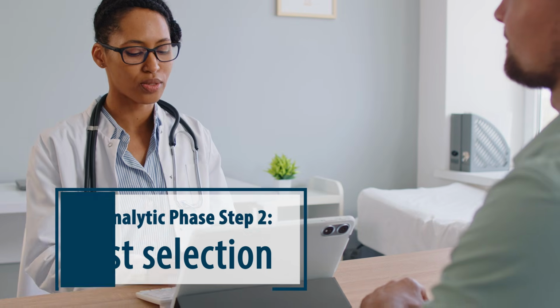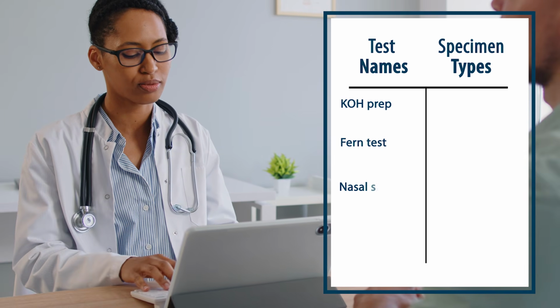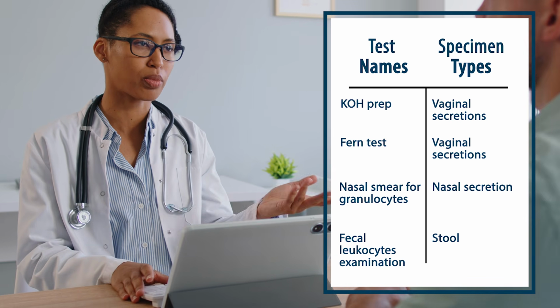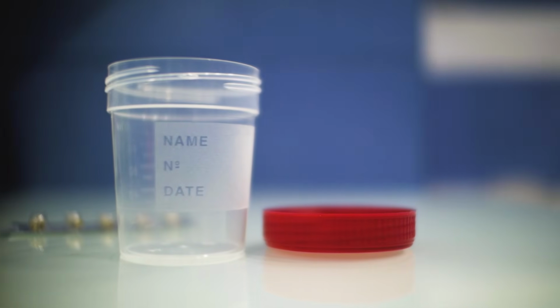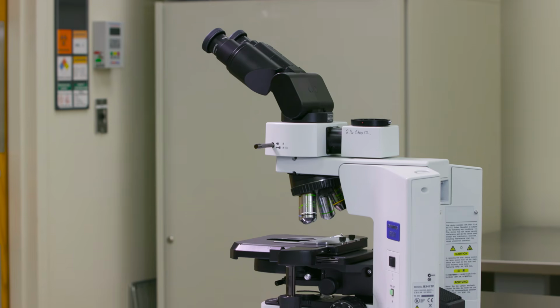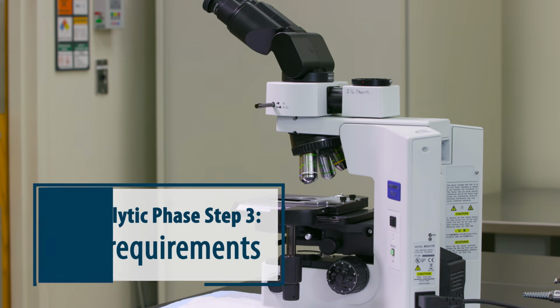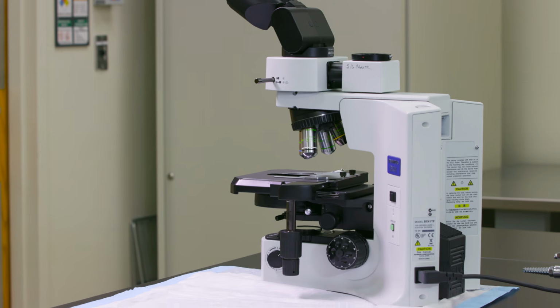One challenge during the pre-analytic phase is the potential for confusion about the correct specimen type required for each test. Review the test requirements to confirm the appropriate specimen type and volume required for the procedure. Ensure you have the correct specimen collection supplies. This is also a good time to make sure you have the required testing materials and equipment ready. The main equipment for PPM procedures is the microscope.